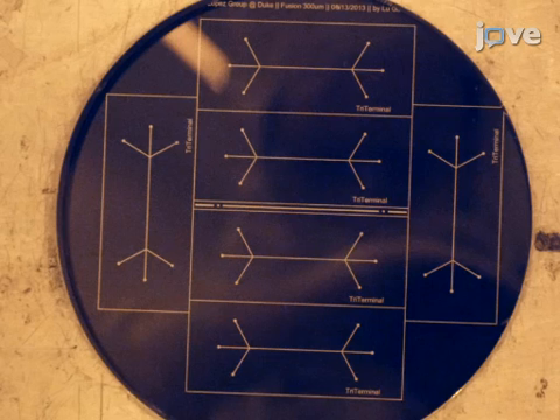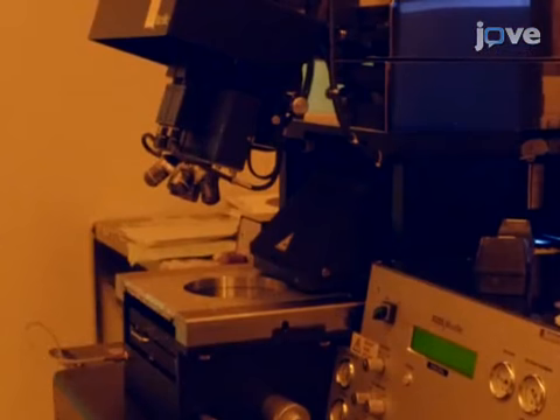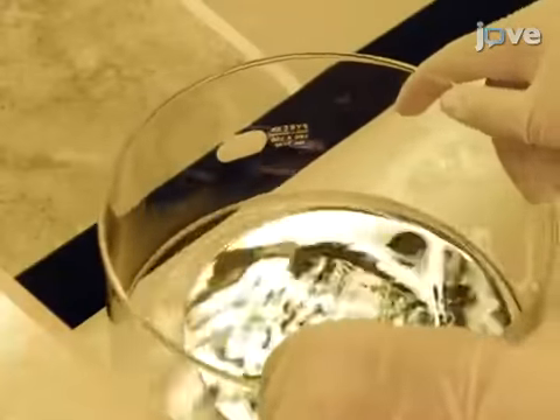While the photoresist bakes, load a photomask like the one shown here into the holder of a mask aligner. Then, load the wafer and expose it with UV light to an energy dosage specified by the photoresist supplier. Next, remove the photopatterned wafer from the holder and place it in a solution of its corresponding developer.